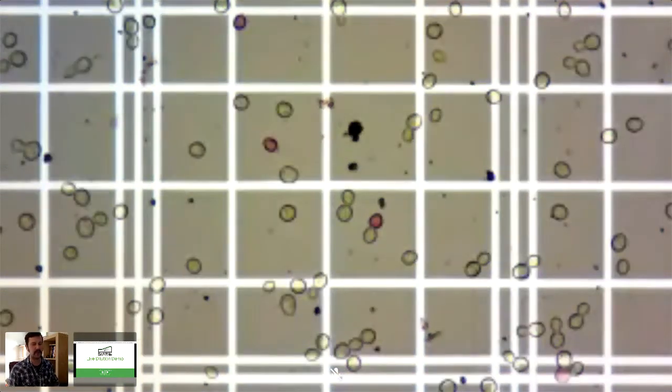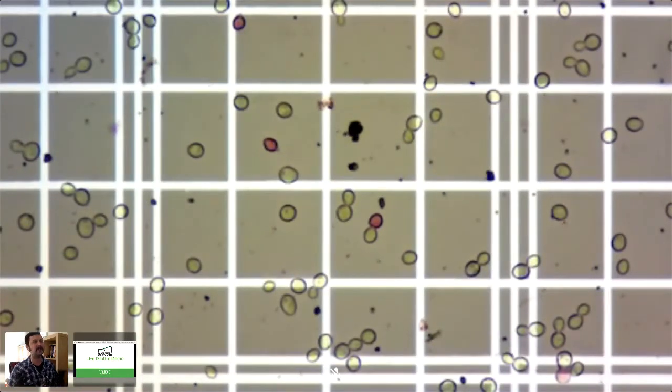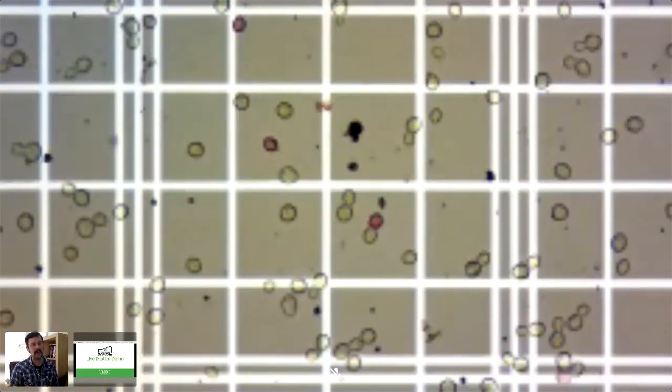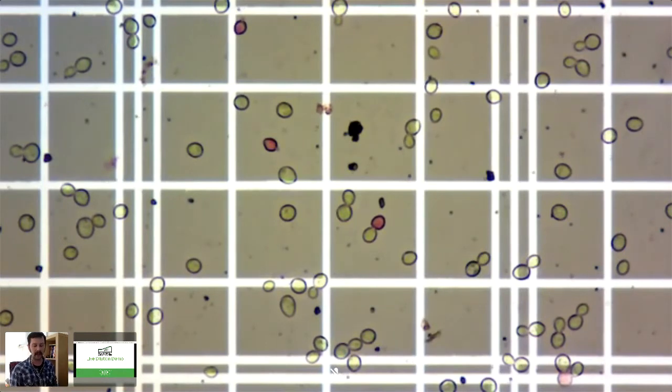Generally, you shouldn't have to use 2 counters to count live and dead yeast. There should not be so many dead yeast that you can't just write each section that you counted on a piece of paper, or count it in your head. I think we generally won't see over like 20 or 30 dead in the worst case. But if you're getting higher than that, let's say you're working with homebrew or a really old pitch of yeast and you want to verify that, then you'll want to use 2 counters or count all the live ones, then count all the dead ones.